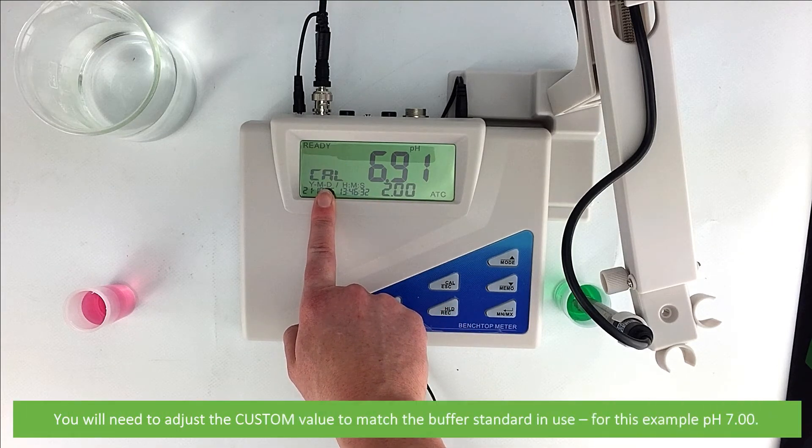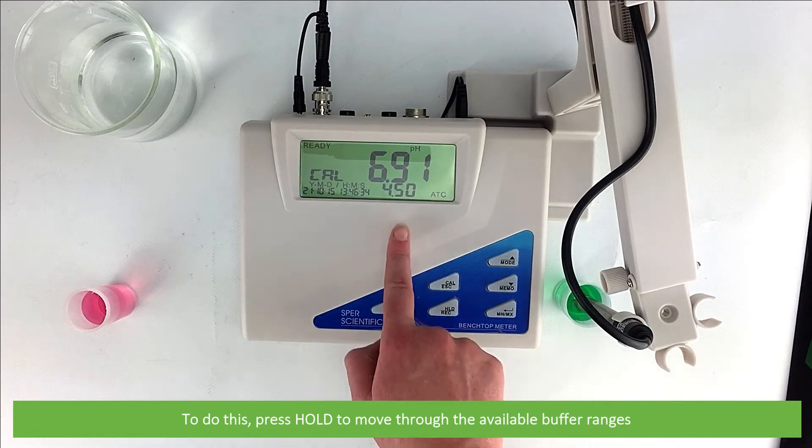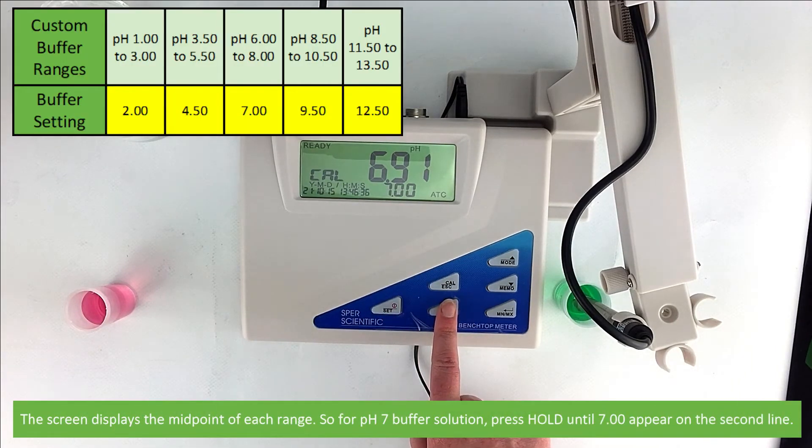You will need to adjust the custom value to match the buffer standard in use, for this example pH 7. To do this, press the hold key to move through the available buffer ranges. The screen will display the midpoint of each range.